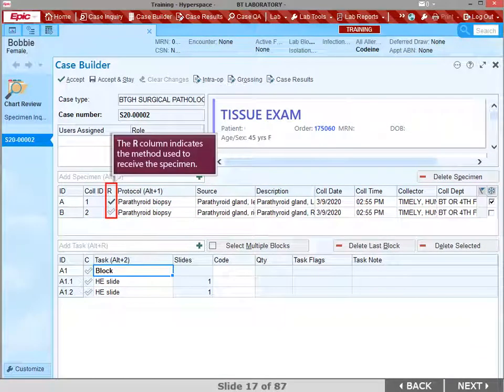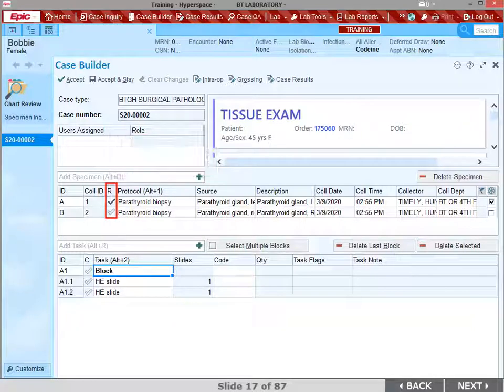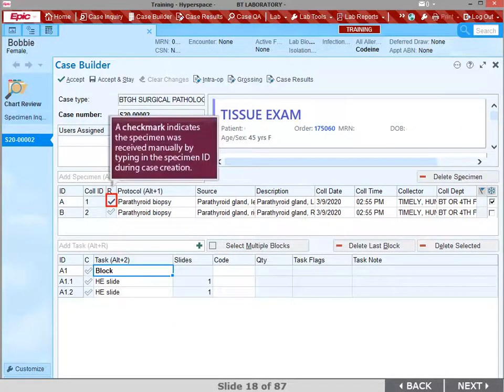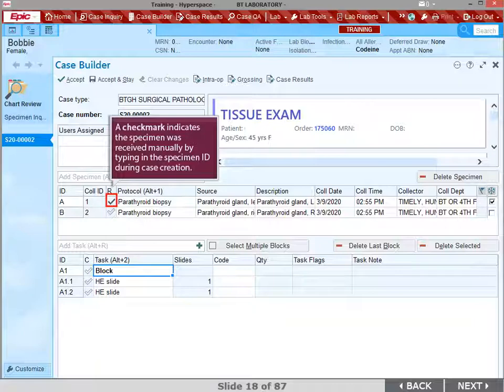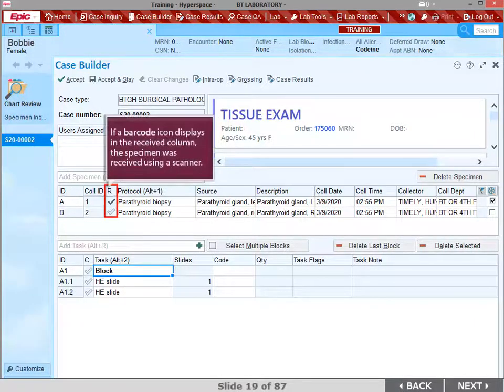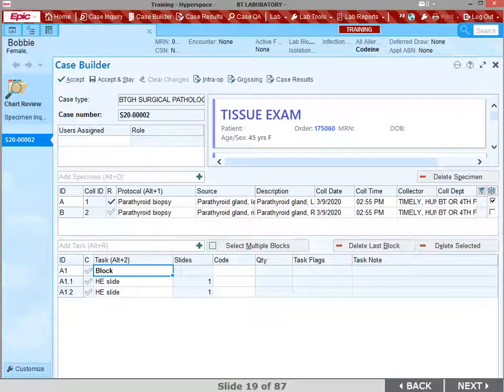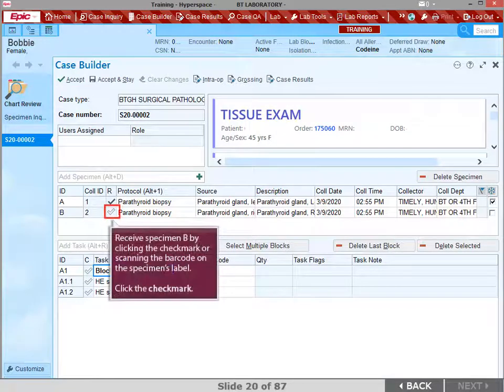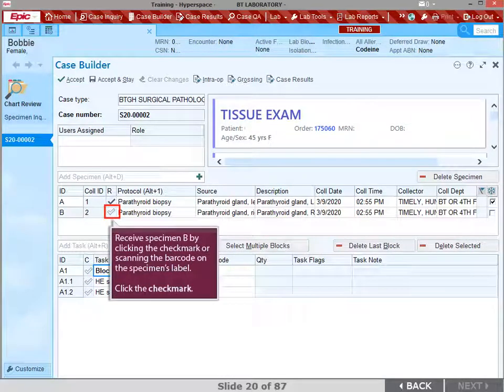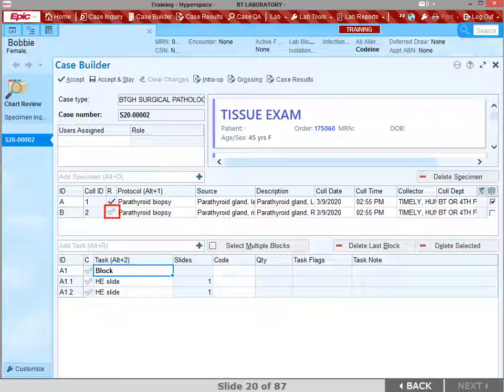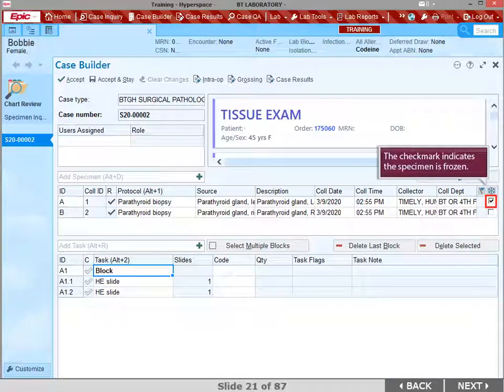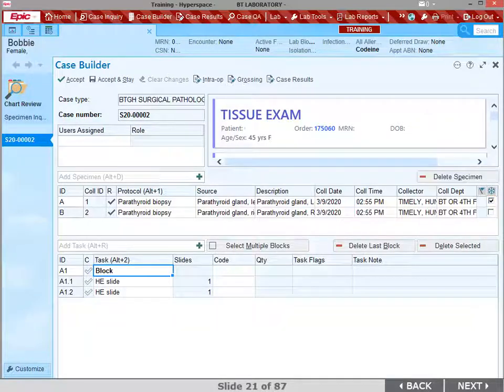The R column indicates the method used to receive the specimen. A check mark in the R column indicates the specimen was received manually by typing in the specimen ID during case creation. If a barcode icon displays in the Received column, the specimen was received using a scanner. Receive specimen B by clicking the check mark or scanning the barcode on the specimen's label. Click the check mark. The check mark in the Snowflake column indicates the specimen is frozen.